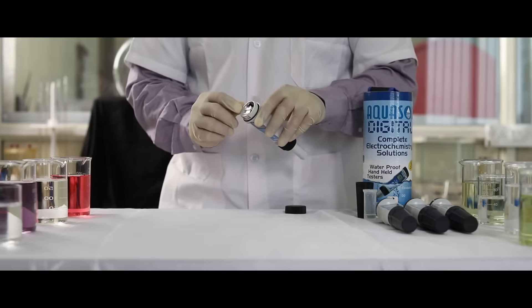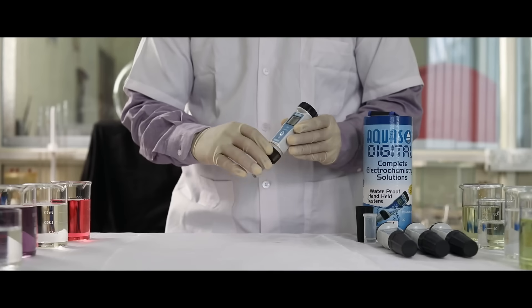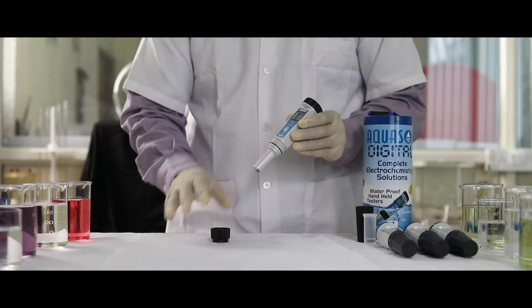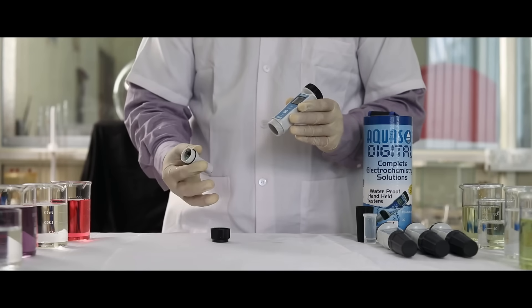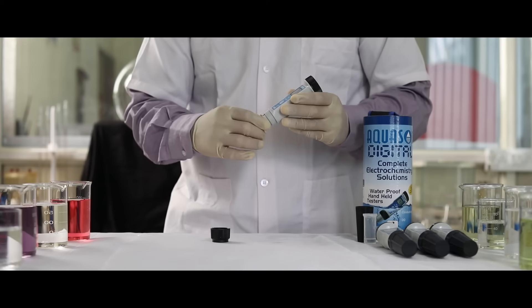To change the batteries, note the polarities and replace the batteries. To replace the electrode, unscrew the electrode column and detach the electrode. Replace with a new electrode and screw the electrode column back.